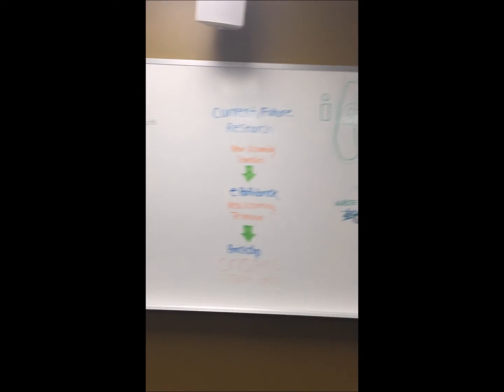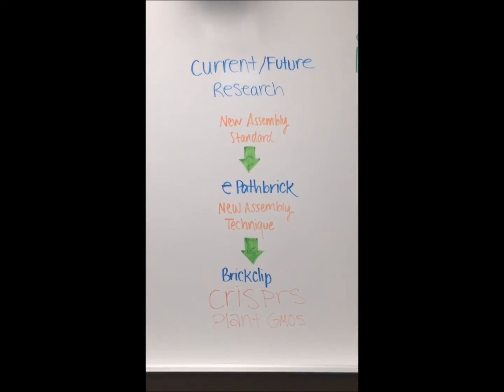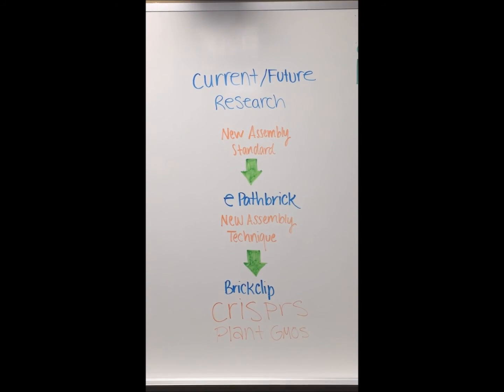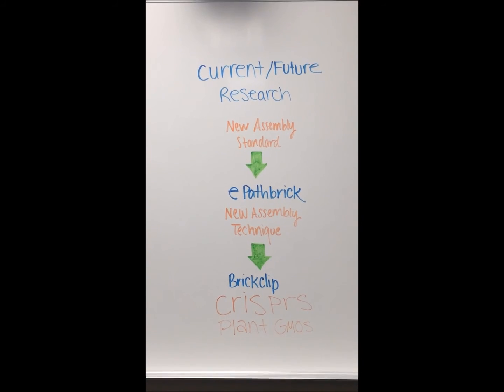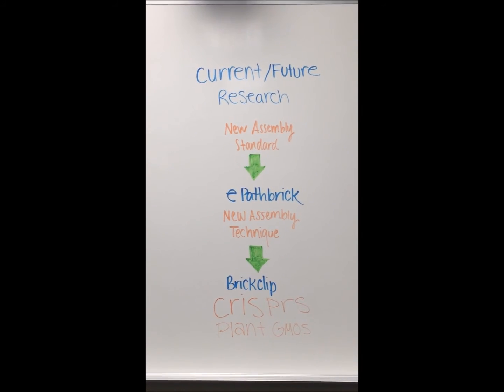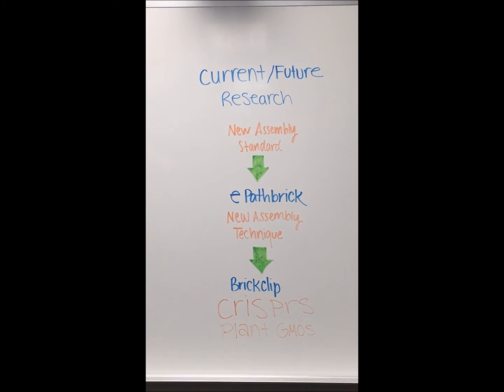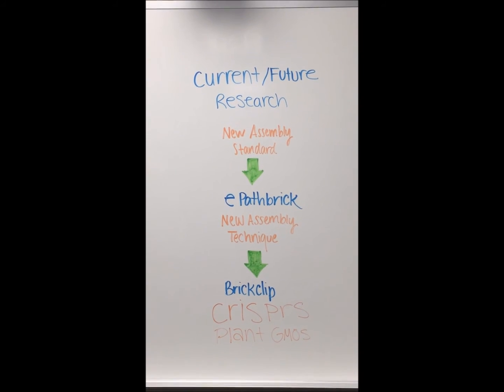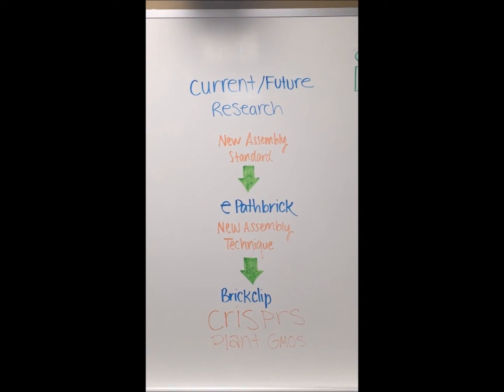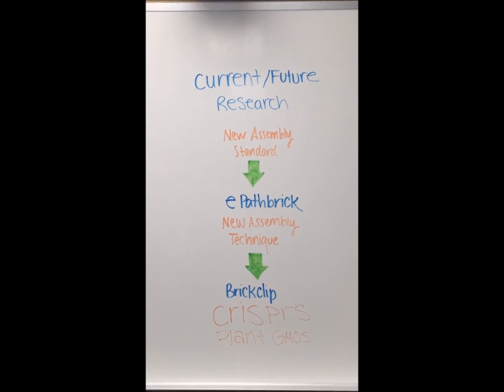Golden Gate cloning has been incorporated into many different research areas. For example, CRISPR technology has adopted Golden Gate cloning to insert oligonucleotides specifying a gRNA target sequence into Cas9 containing plasmids. Golden Gate cloning is also being used with standardized parts to construct multi-gene constructs for plant transformations. In the future, it is likely that Golden Gate cloning will be used in other research areas and will become more popular than traditional cloning techniques.